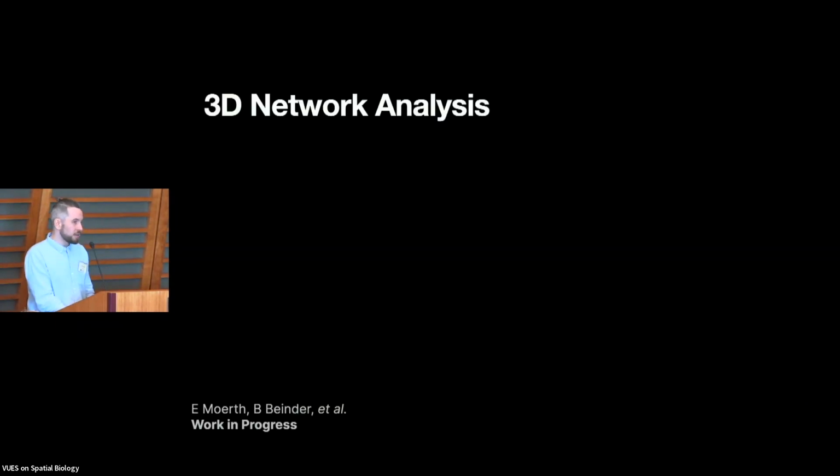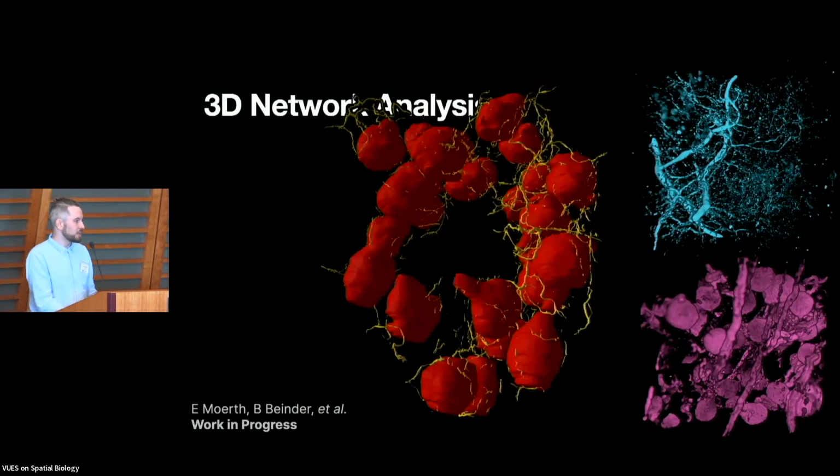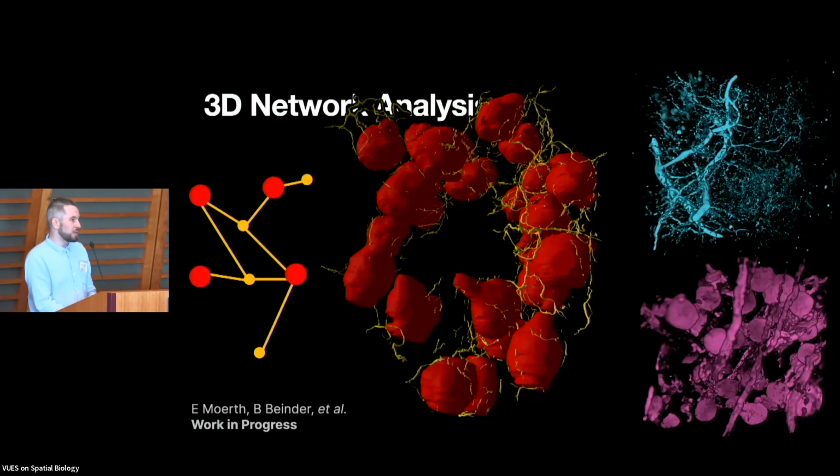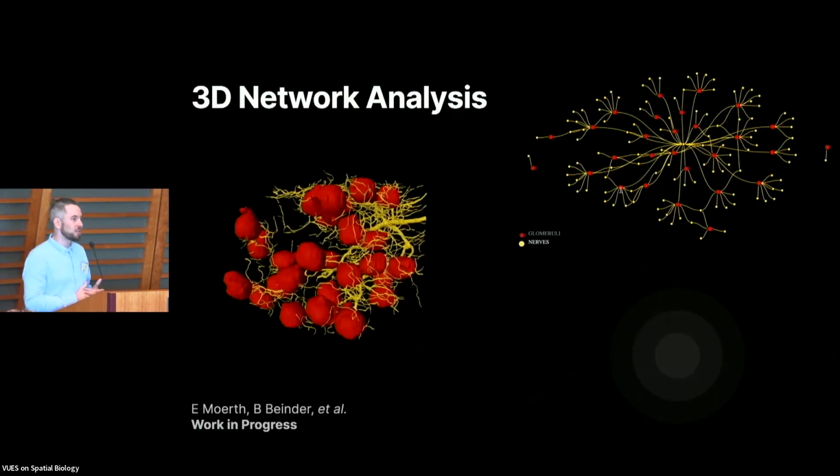So that's one. And then the other thing that was very much inspired by Sanjay, because we talked a lot about 3D network analysis, and we've seen it now in their tool. In parallel, we also tackled the problem together with them, and we took a more visual approach. So we always try to have it in an interactive way. So what we're proposing is also 3D network analysis, same data as Sanjay showed. We're using their segmentation masks, and then we derived the network from it. And like I said, our approach was more to get it more interactive. Because we're working closely together, we can also see how well this can help to find maybe more motifs or find those in larger networks.